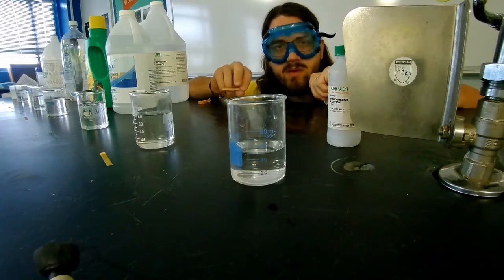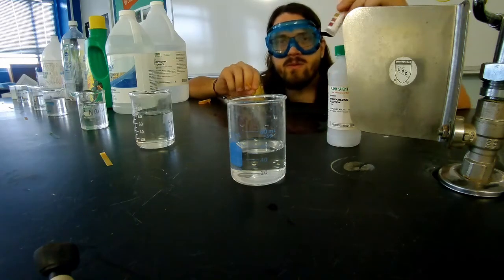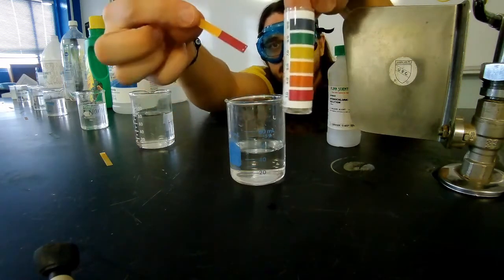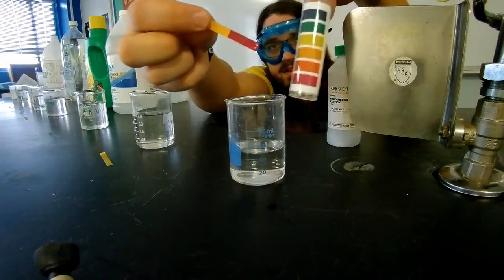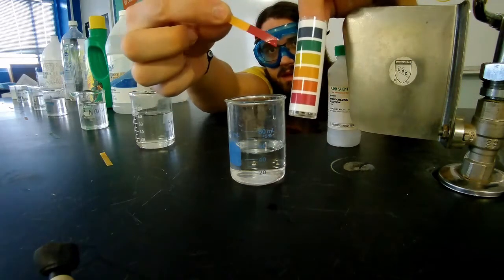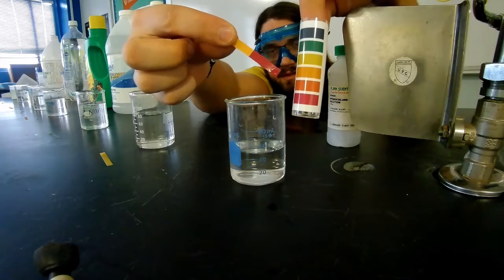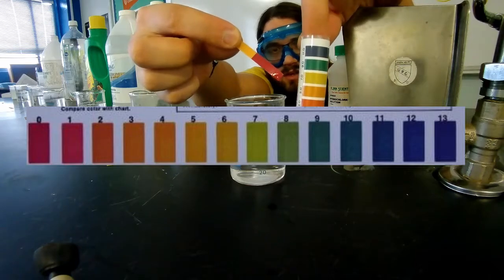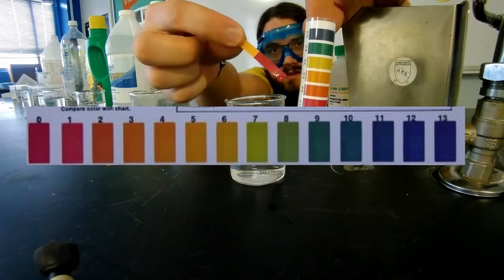Well, let's see. We have hydrochloric acid. I wonder what it's going to be, an acid or a base? Well, look at that. Pretty obvious color change there. Take a moment, write down the pH, and if it's an acid or a base.